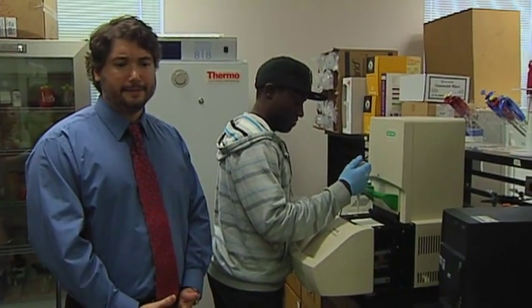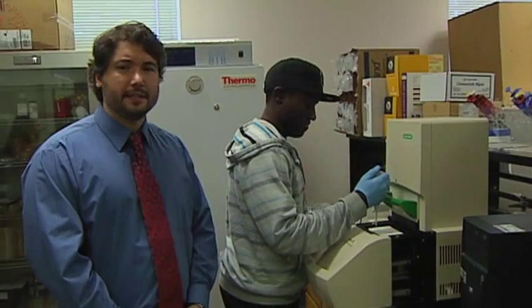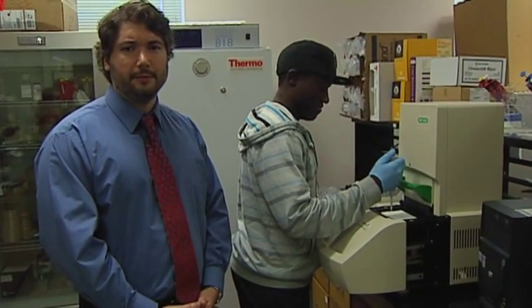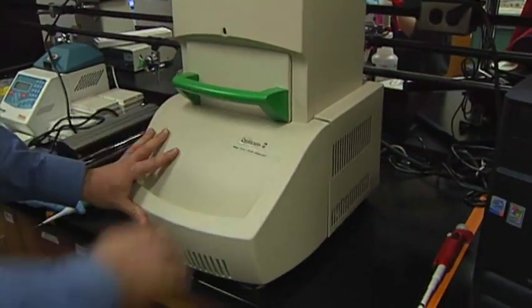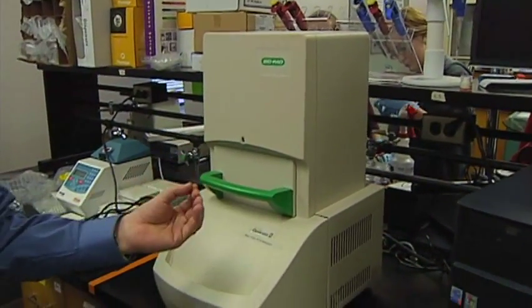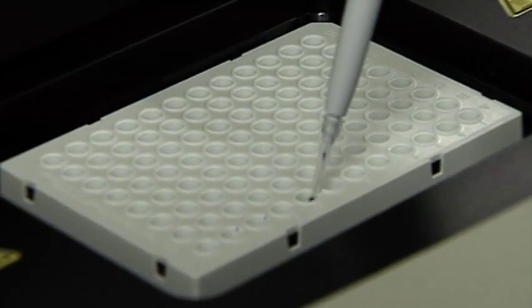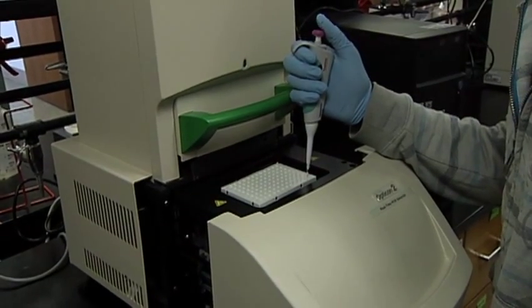It's used by several universities and forensic laboratories to generate DNA fingerprints for crime scene analysis. We also use it as a very valuable tool in research to analyze the magnitude and the timing of the expression of genes. It shines lasers through each sample well to monitor fluorescence over time. The fluorescence is related to how much product is being produced during the polymerase chain reaction.